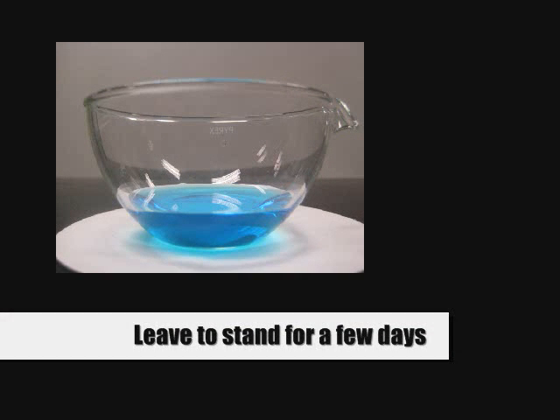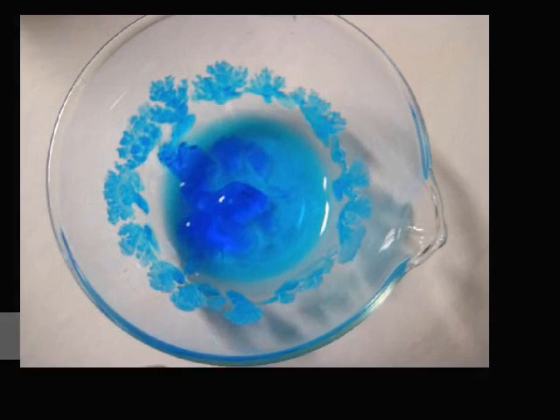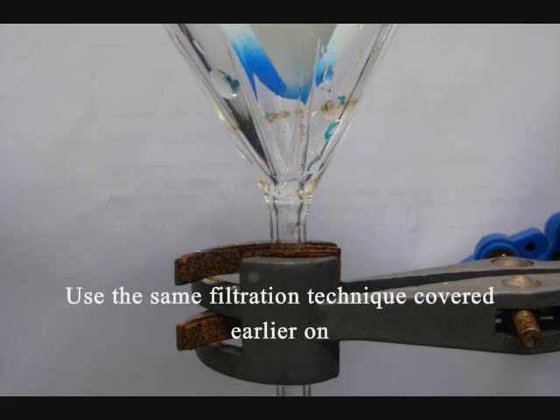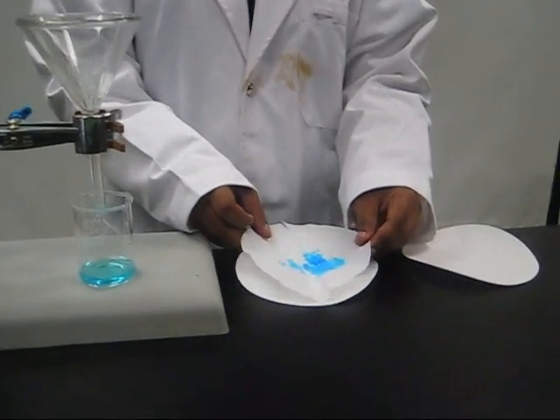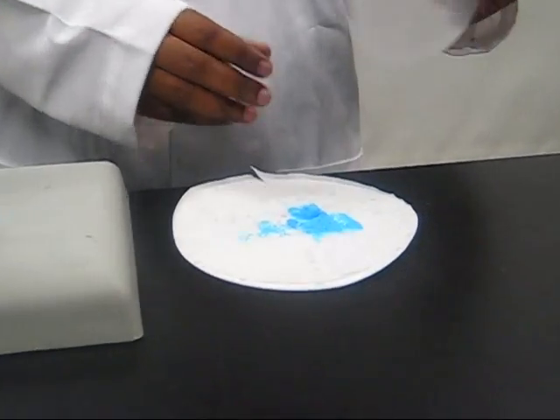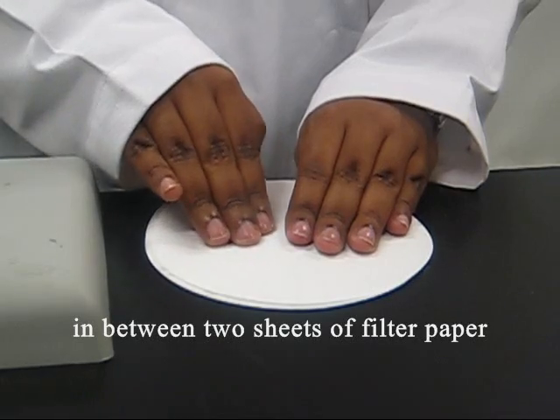Leave the solution to stand for a few days — crystals will start to form after about 4 days. Collect the crystals using the same filtration technique covered earlier, then press lightly to dry the crystals in between two sheets of filter paper.